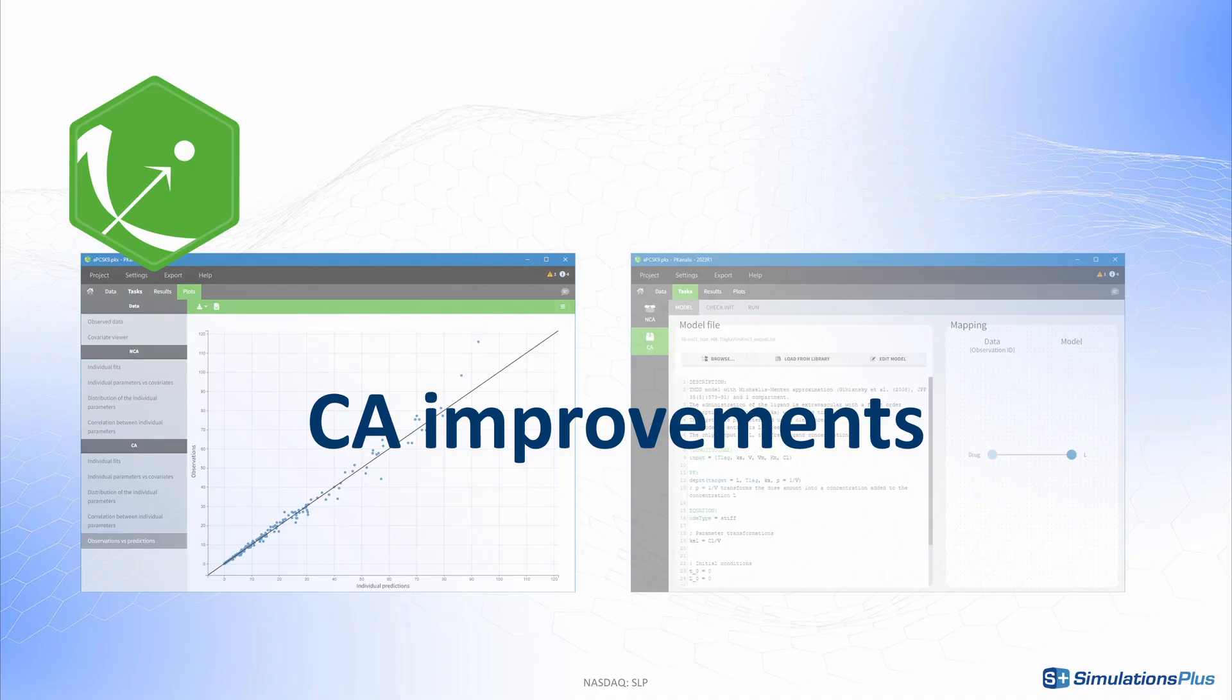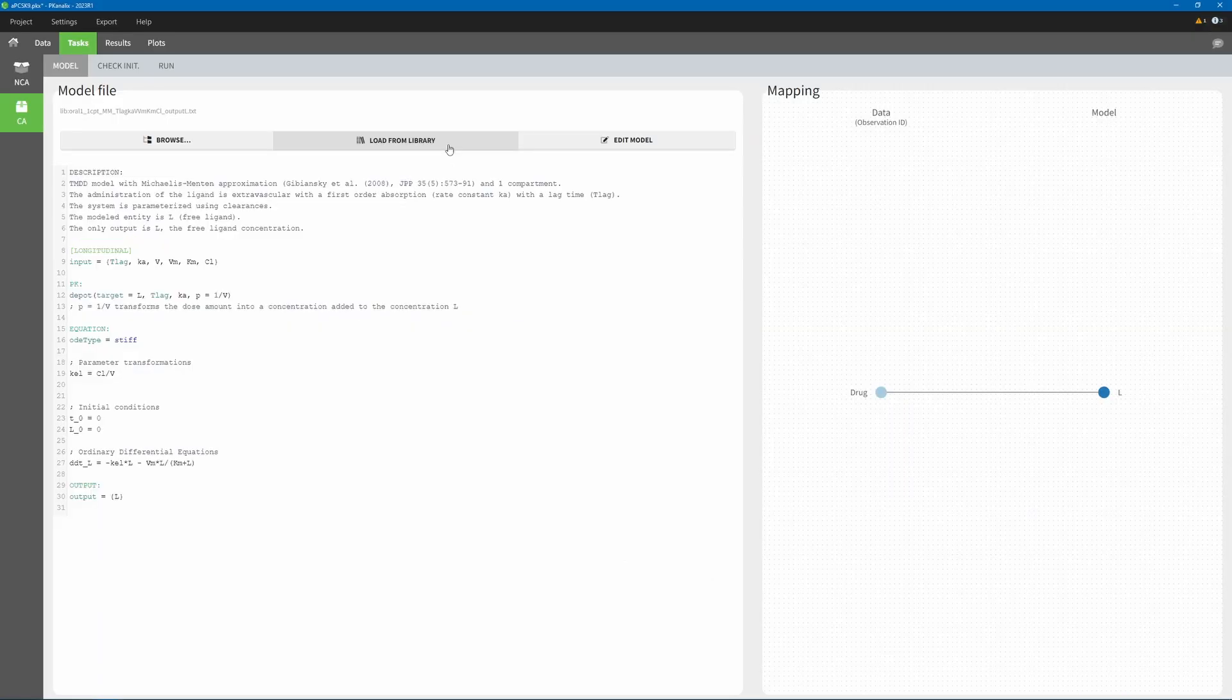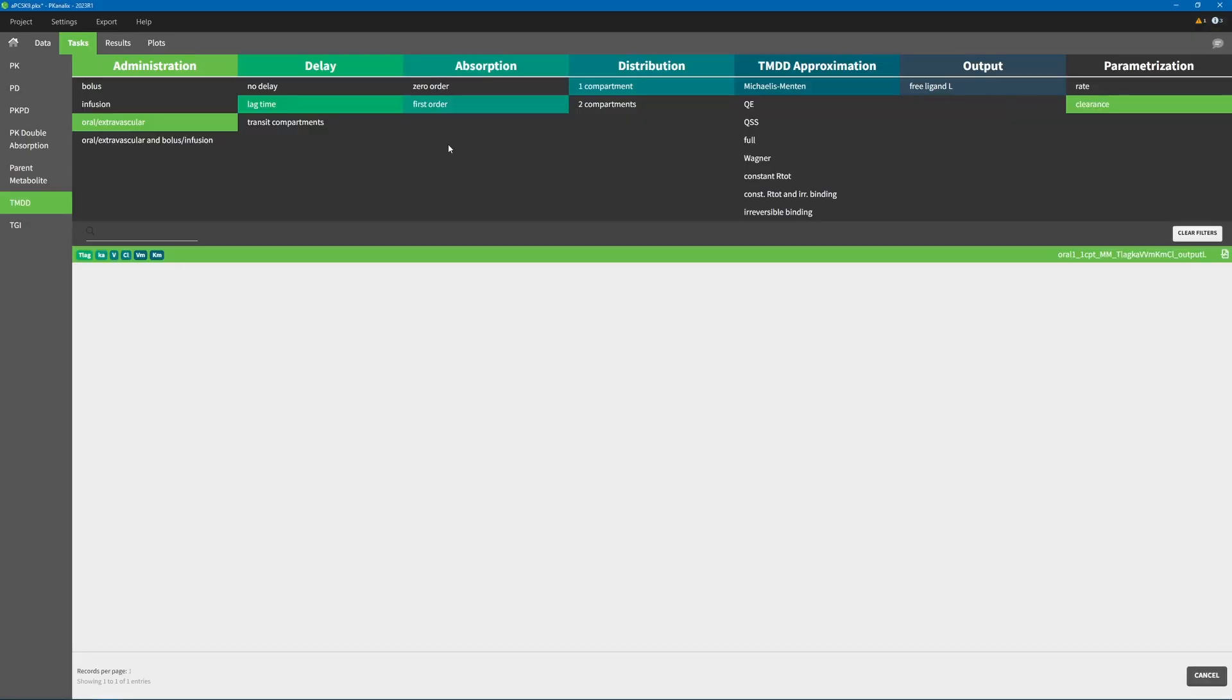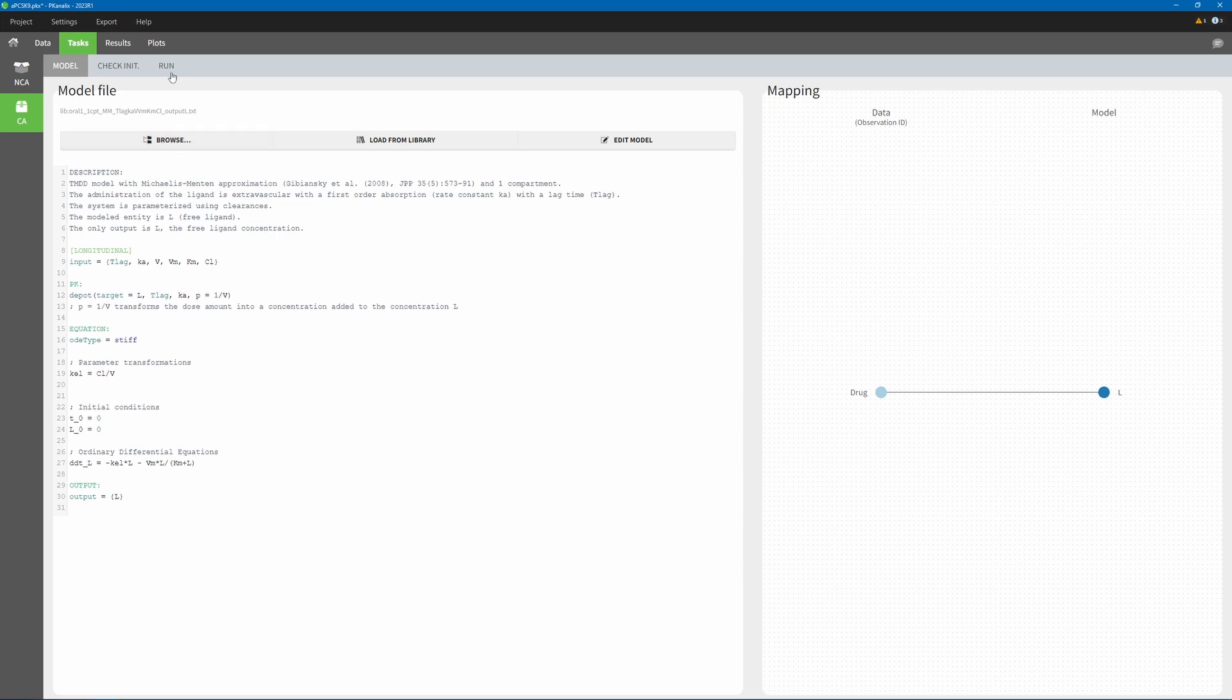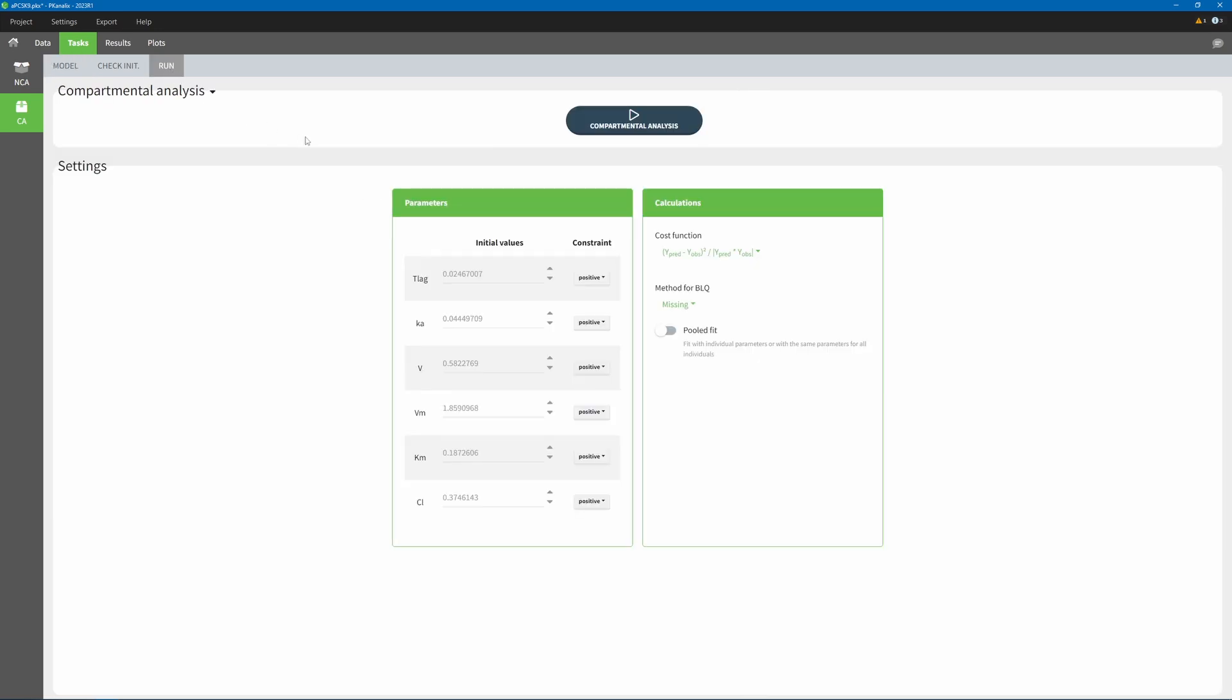A lot of changes have been made to the compartmental analysis module of PK Analytics as well. It is now possible to use library models for multiple libraries, or even custom models written using the MLX run syntax. The new weighting option, one across YPRED times YOBS, was added and is set by default. The CA algorithm has been improved to have a better chance of escaping local minima and improving the fit.